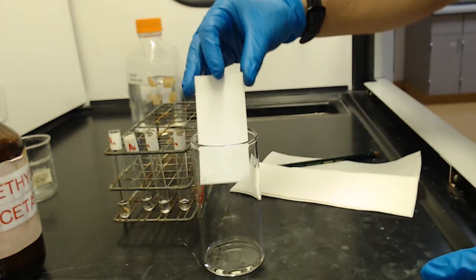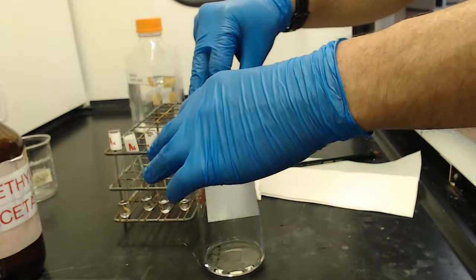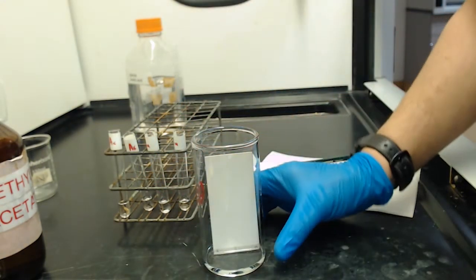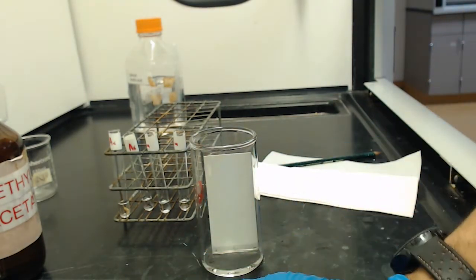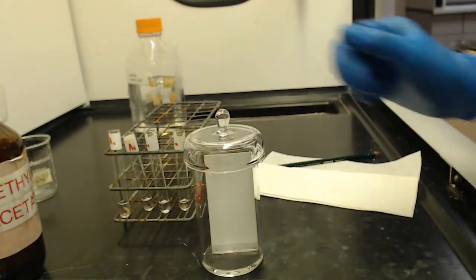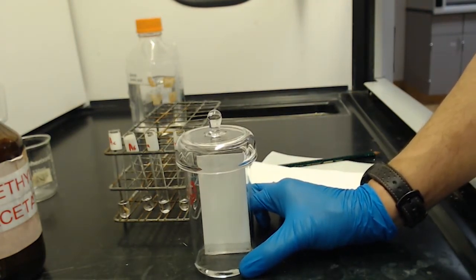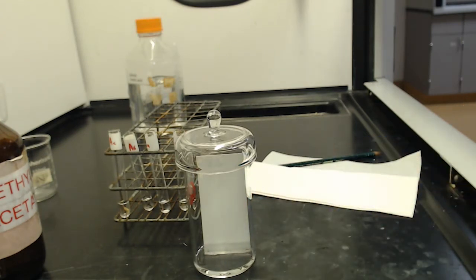So I'm going to go ahead and set it in here. You could use a pair of forceps or tweezers. And then you just let that go. They typically take about 10 minutes or so, roughly. I'm seeing on the camera very clearly that the solvent is climbing up. If you don't have the lid on there, the solvent will climb up and then evaporate, and it'll continuously do that, and you don't get actual chromatographic separation.